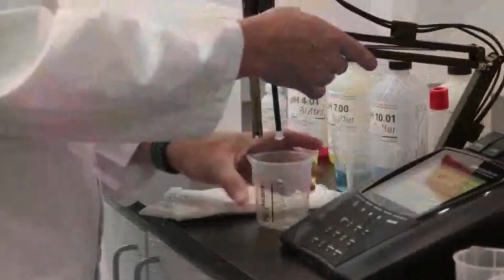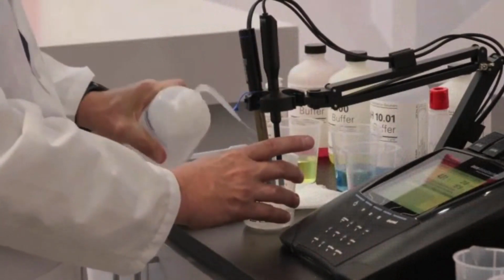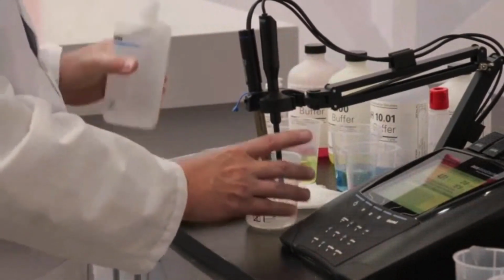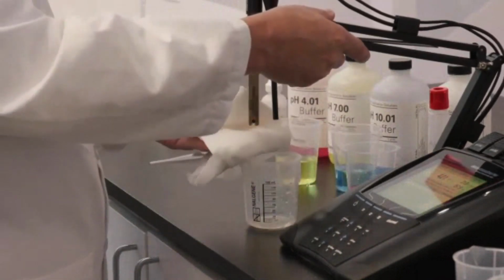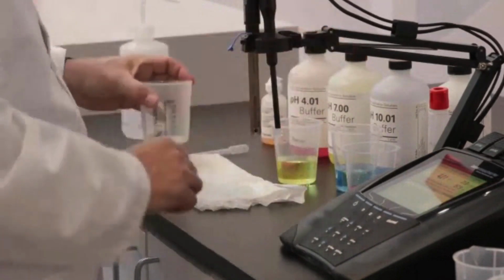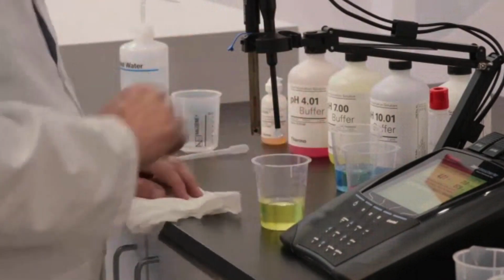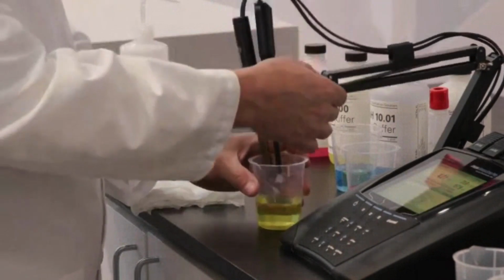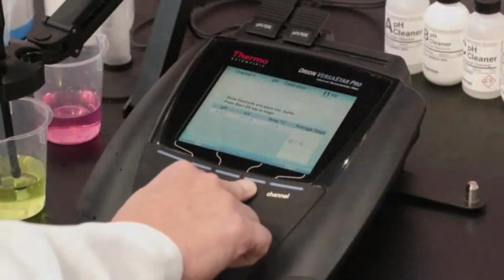So he's going to take the electrode out, rinse it with plenty of reagent grade water here. He'll rinse the electrode and the stirrer, everything that extends into the solution, and just blot gently with a little bit of paper towel there, or a wipe. And now we're going on to our second electrode, our second buffer solution. And here we go.